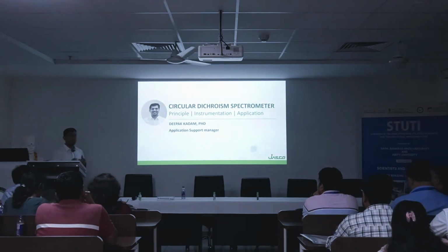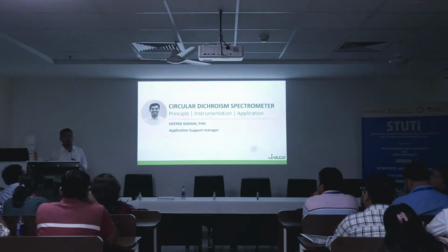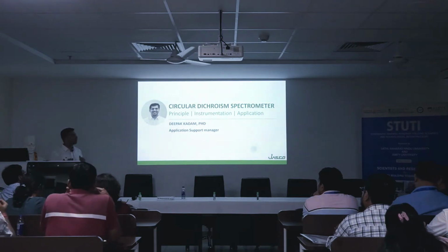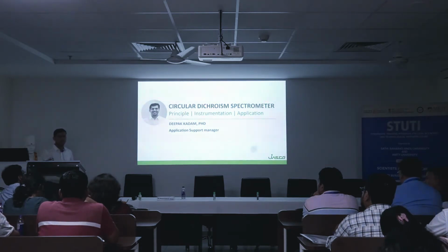But I don't have to explain all the theory and the science behind circular dichroism. When it comes to sampling, there are questions on purity, what kind of amino acids, proteins or peptides, what kind of results we will receive from this instrument, what we are looking for, and what you should be looking for. That I will try to cover.